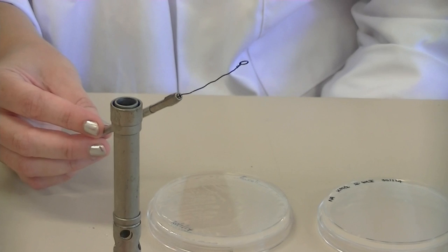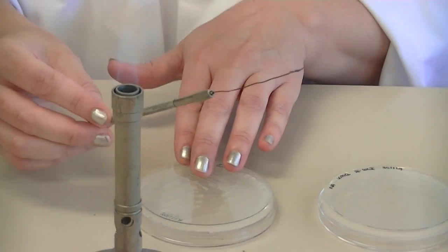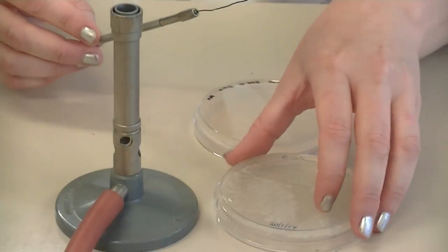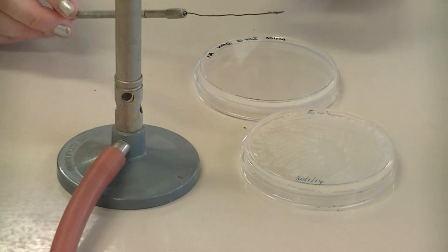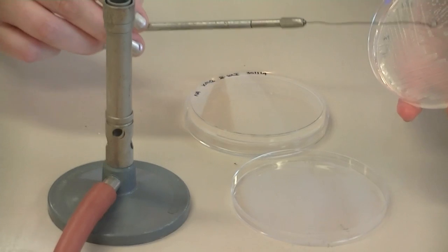The loop needs to be cool because if it's very hot, it can actually kill the bacteria or yeast that you put onto your loop. In this example, I have some E. coli on a solid medium, so now my loop is sterile and cool enough — I'll just check by touching it to the surface of the plate.